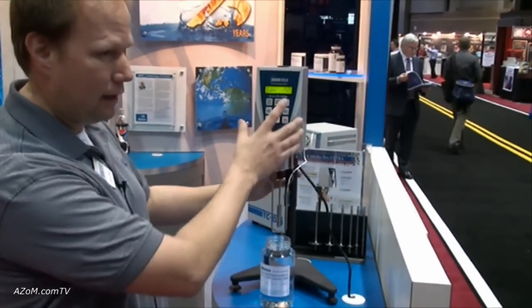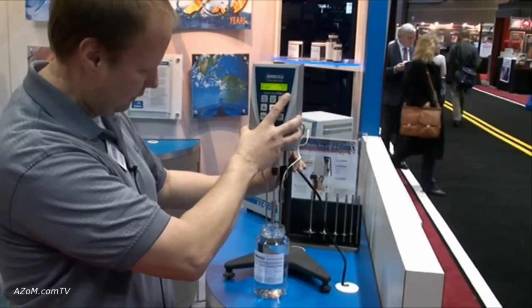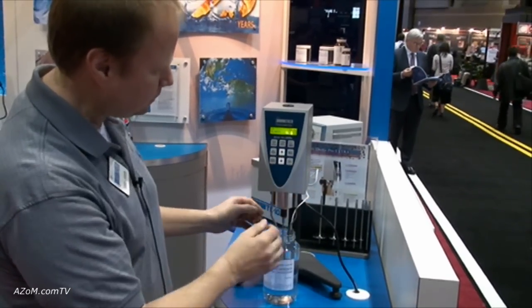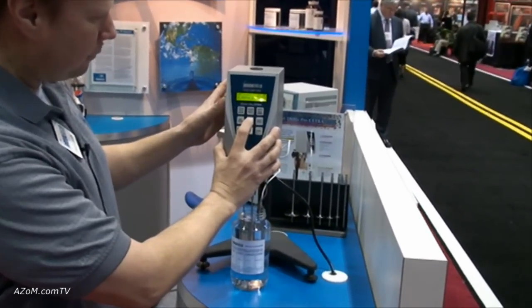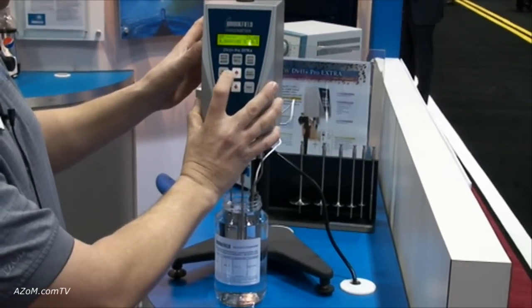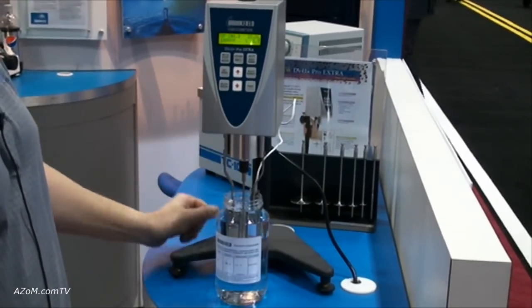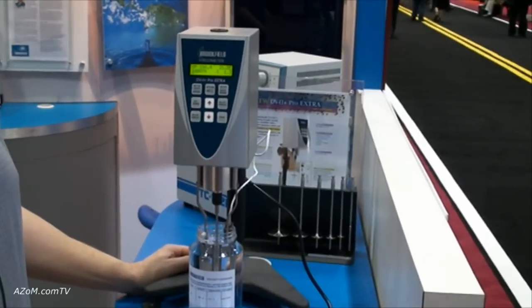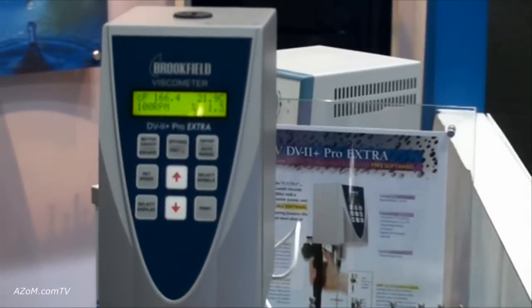We have the spindle on and we put it in — you just drop it into the fluid, start the motor at the proper speed, let it go, and it will give you the measurement in viscosity. And that's as simple as that — a 30 second test.